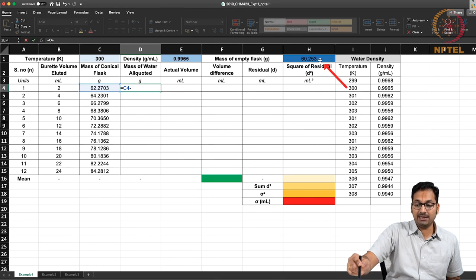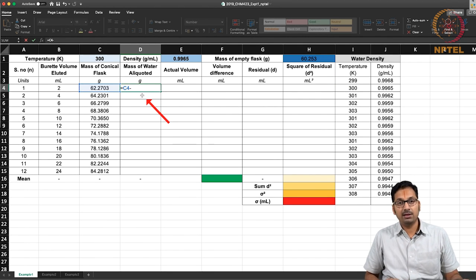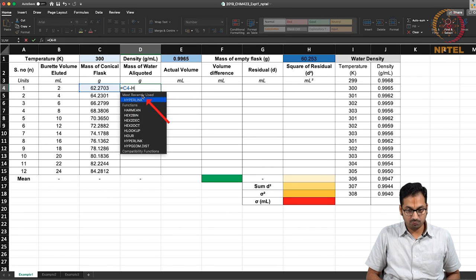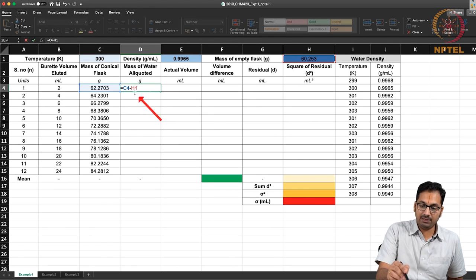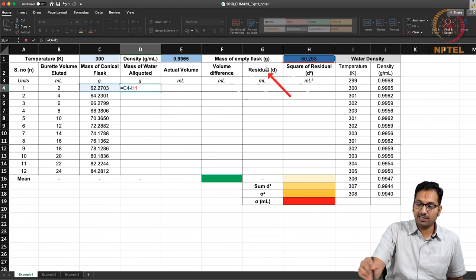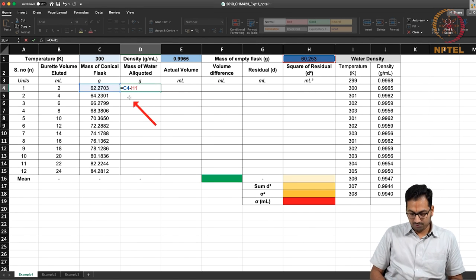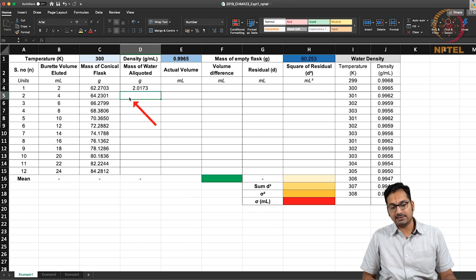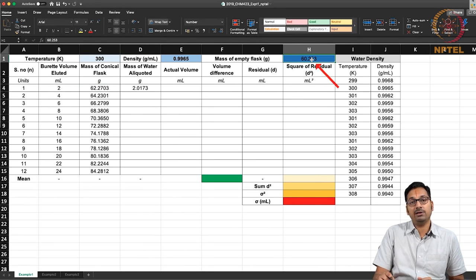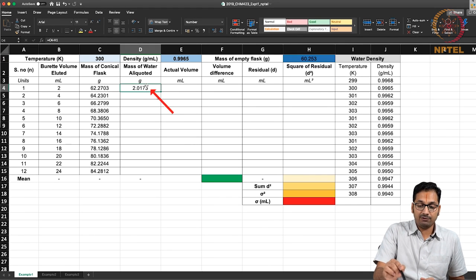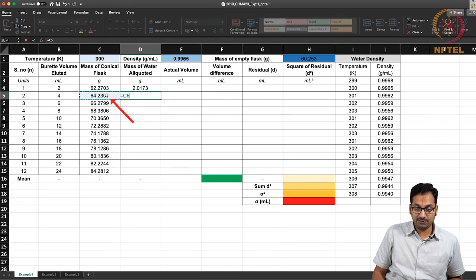You want to take the difference between the mass of the conical entered in cell C4 and the mass of the empty conical in H1. So you write the formula C4 minus H1. C4 is highlighted in blue while H1 is highlighted in red, which helps you understand which two parameters you are taking a difference between. Once you hit enter, it carefully calculates the difference between this value and that of the empty conical flask. You can repeat the same process by typing C5 minus H1, and so on.